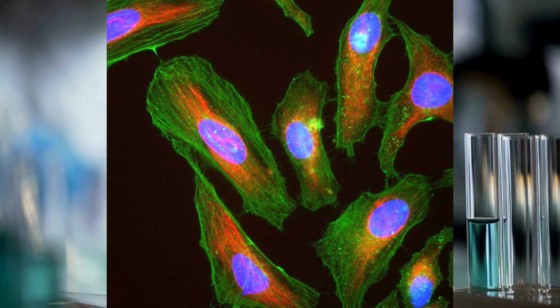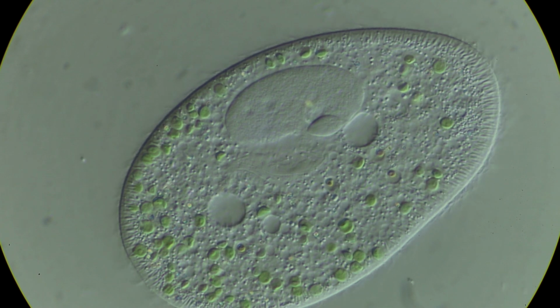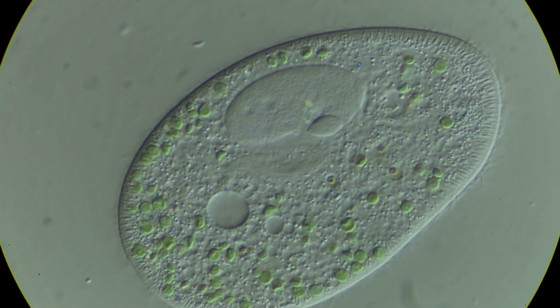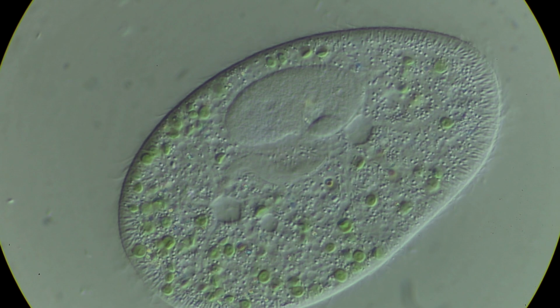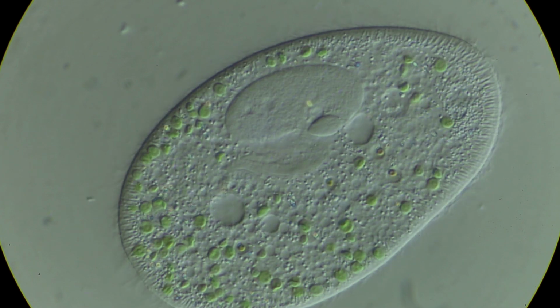Now you use a microscope made to apply a certain wavelength of light. That wavelength of light should correspond to the wavelength at which the thing itself will fluoresce, and so, with the fluorescence, you can now image it. This will allow you to see the thing you're interested in without having to look at all the other details necessarily. This is similar to how you can genetically modify an organism to be visible on the whole. This is typically done using green fluorescent protein and is a very common undergraduate experiment to demonstrate genetic modification.